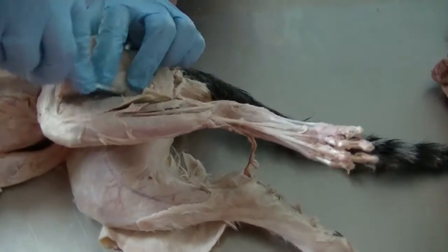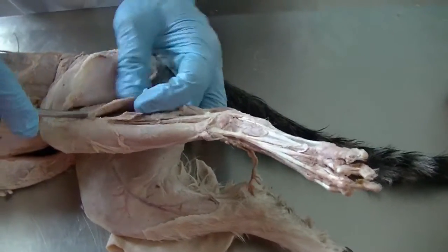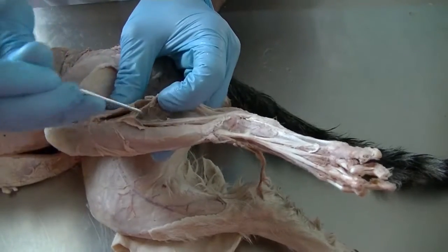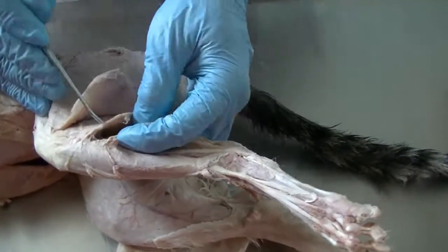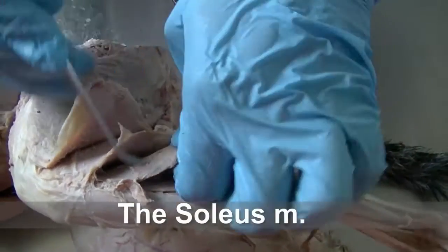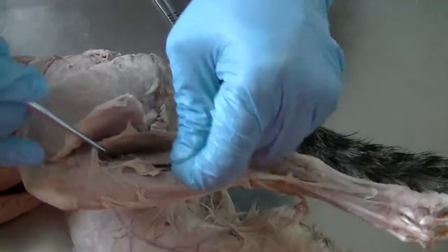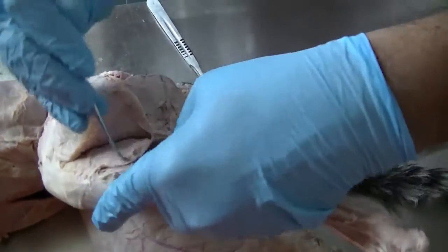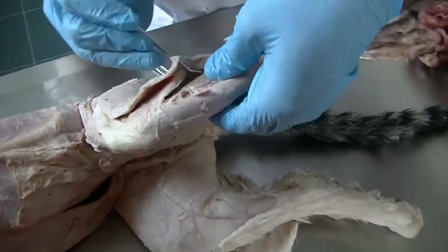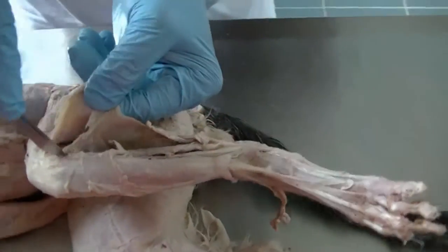Along with the lateral head of the gastrocnemius, we will observe that there is another muscle which runs between the tibia and the common calcaneal tendon, that is the soleus. The soleus, which is fairly large, needs to be differentiated from the superficial digital flexor as well, or it might be confused as superficial digital flexor muscle.